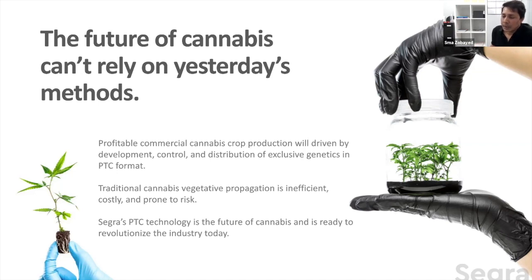If none of these produce good enough results, those plants go straight to the research team, and they develop another protocol. Even if we have a lower multiplication, we try to avoid inducing so many different media, because commercially it's really difficult to produce small batches of media. We try to give them the first, second, or third if possible, even with a lower multiplication, so we can make a bigger batch of media and save the labor. I hope I answered your question.